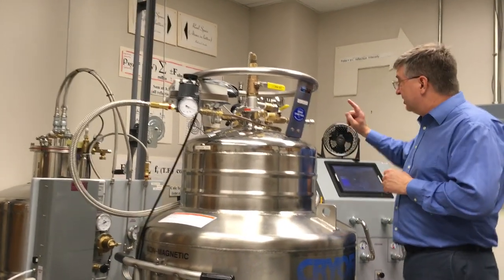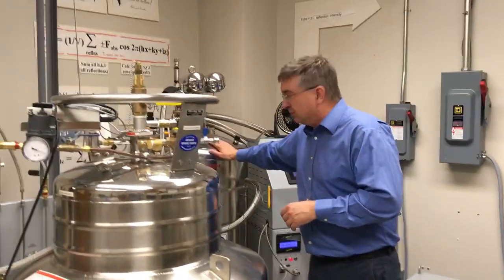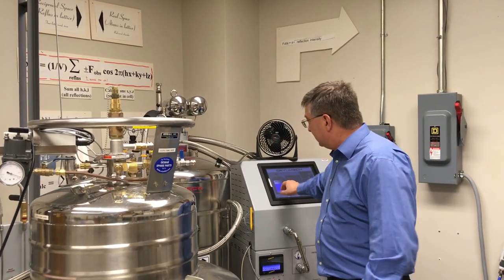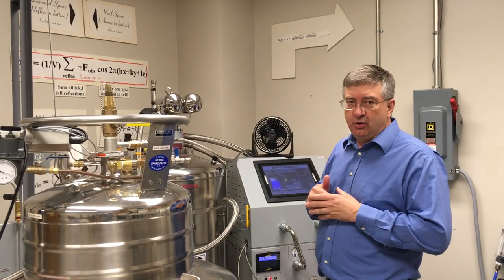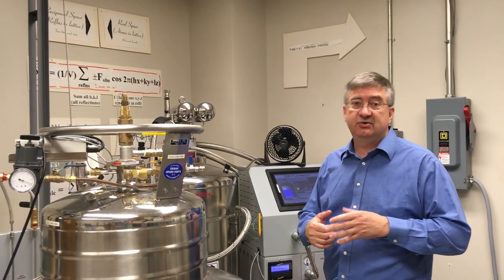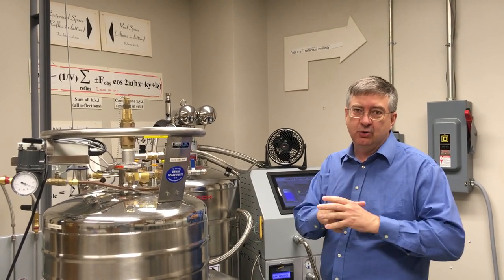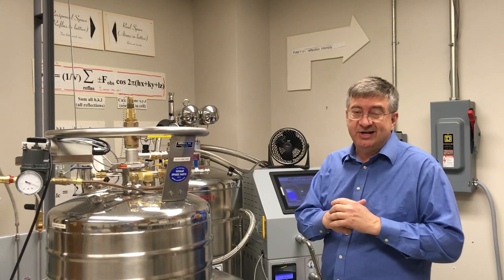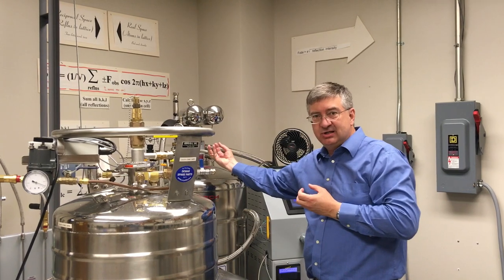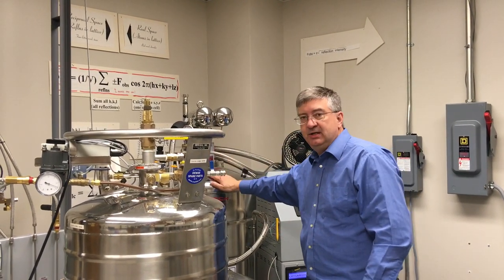We want pure helium that then goes into this compressing unit here. This is another Dewar in which liquid helium is stored — it's nearly full right now, you can see it on the screen. It has what's called a cold finger. This is a compressor too, but a bit different — it actually uses helium as a refrigerant. We cool compressed helium and let it expand to cool it to below 4 degrees Kelvin. The helium gas comes in here, condenses on that cold finger right up in here, and drips down into this Dewar.